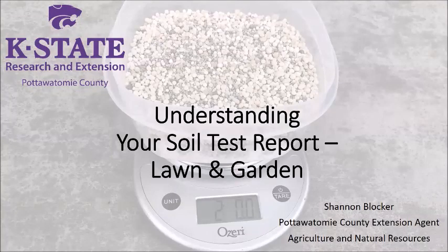So you've taken that all-important first step and soil sampled your garden and now await the results. The basic soil test said that I would learn about my soil's pH, buffer pH, phosphorus, and potassium. Will I need to be a soil scientist and a math genius in order to use these results?